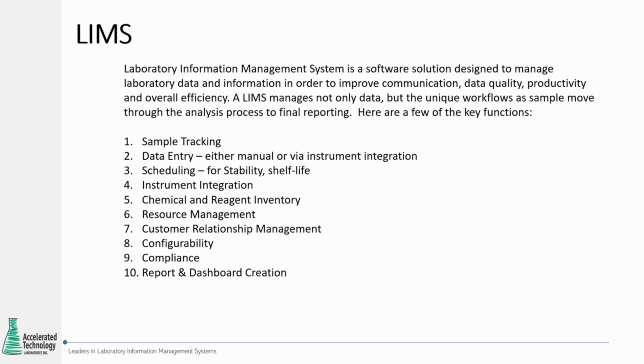Now, scheduling, this is a function that can be used for stability studies, for shelf life studies, for sample collection. It's a feature that allows the analyst to set up projects or programs where the system will send automated reminders of what samples need to be pulled, what tests need to be run.